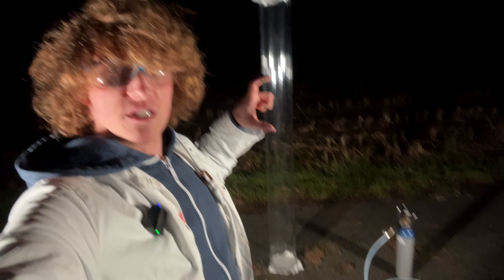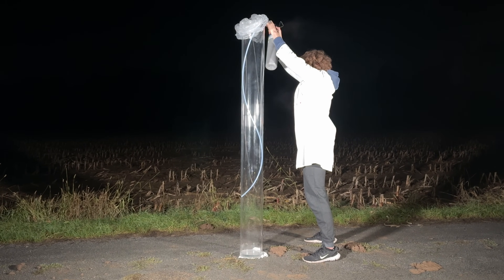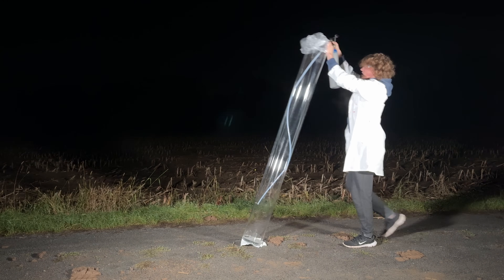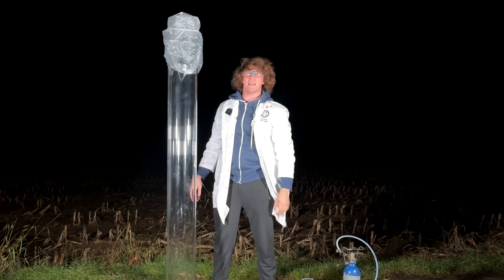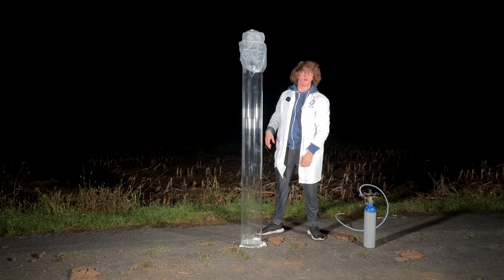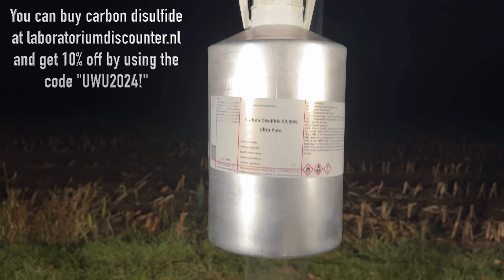It's a pretty big tube, isn't it? Because I didn't want to waste any nitrous oxide, I stuck this small plastic tube into the big plastic tube. I can somewhat taste and smell nitrous oxide — that's why I tipped over the tube. As I smelled it, I know it's decently full, and I'm going to add carbon disulfide.